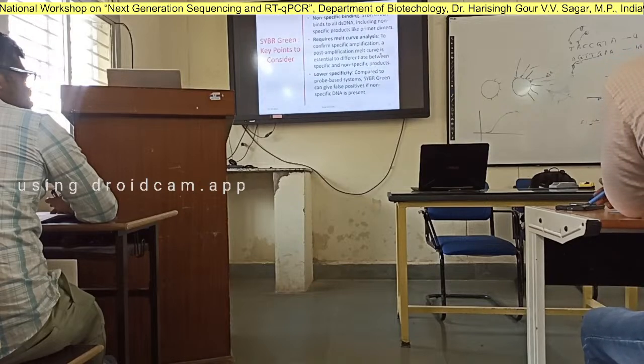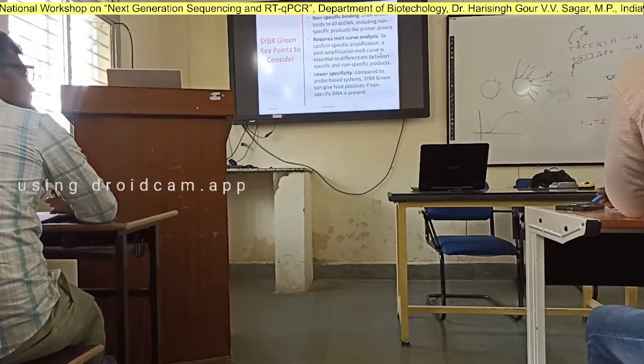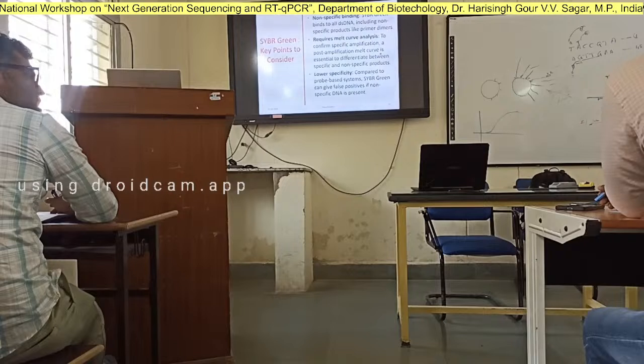लेकिन मुझे फायदा क्या होगा इससे? मेरे प्राइमर सिर्फ exon जाके बाउंड्री में जाके फाइंड करे, what can I effectively rule out? Exactly, there, even if there is some genomic DNA contamination, very unlikely that genomic DNA will be amplified.